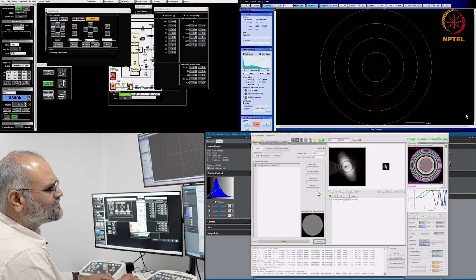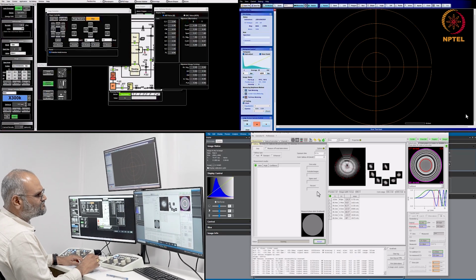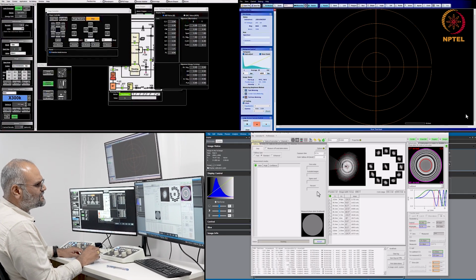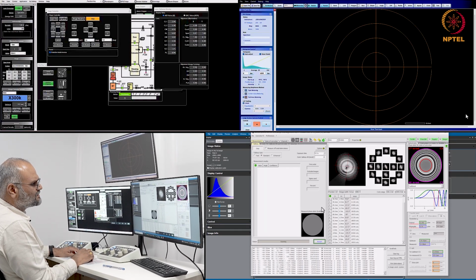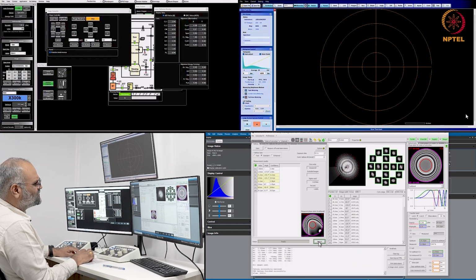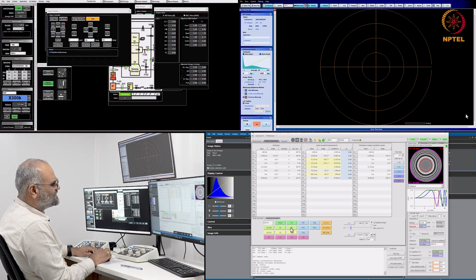these values, I have to correct for the lower order astigmatism first, which is A2, B2, and then A3 plus S3.